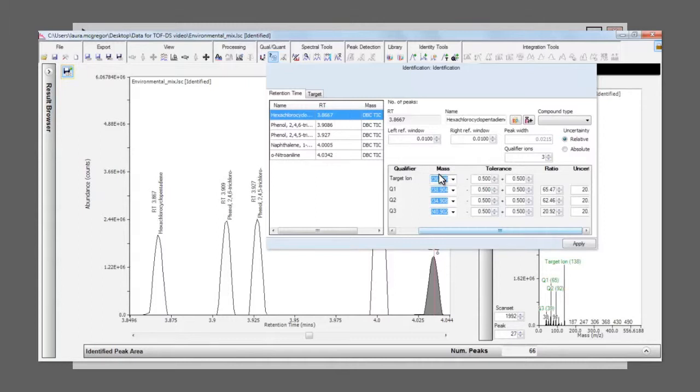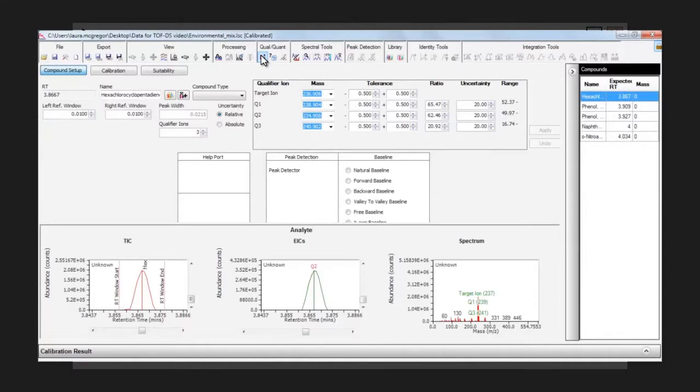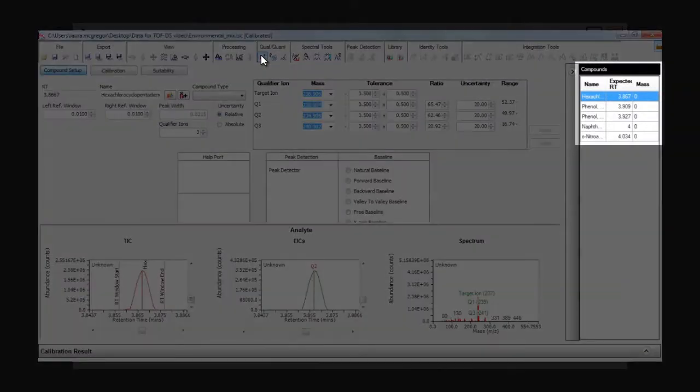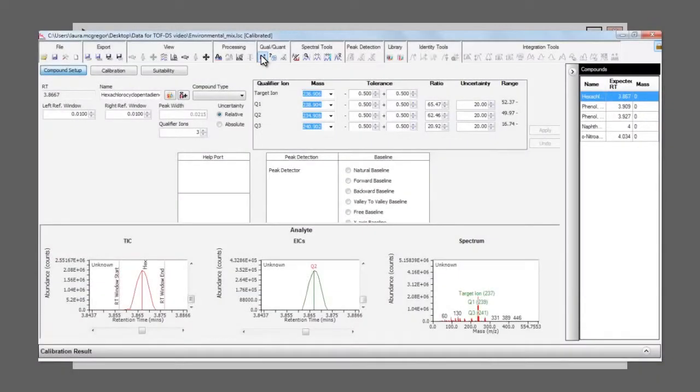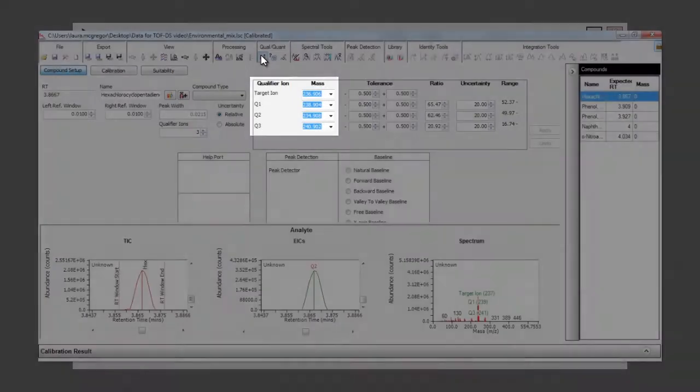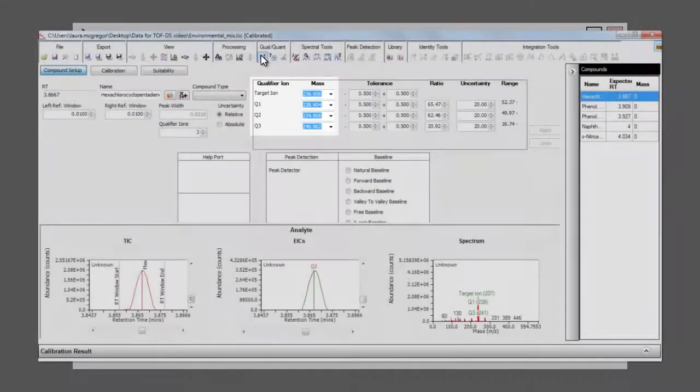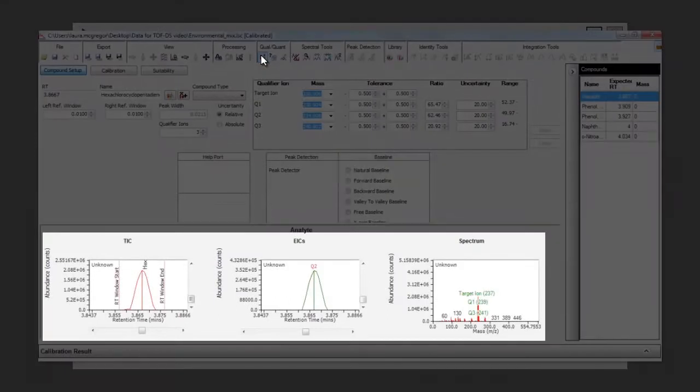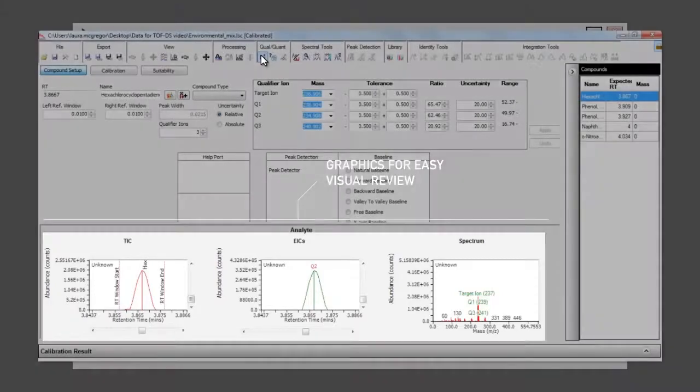To set up the rest of the quant method, we select the calibration icon, which automatically transfers all the information from the retention time table. The calibration view shows the same quant and qual ions, with graphics of the TIC, the EIC overlays and the annotated spectrum for each of the target compounds.